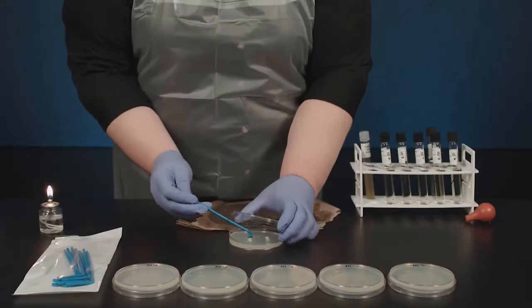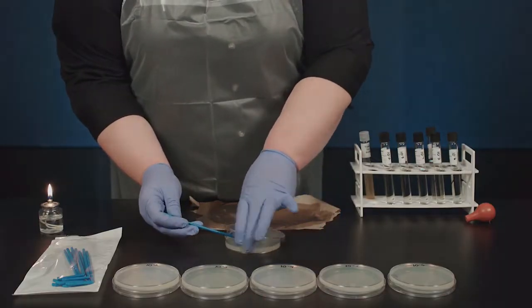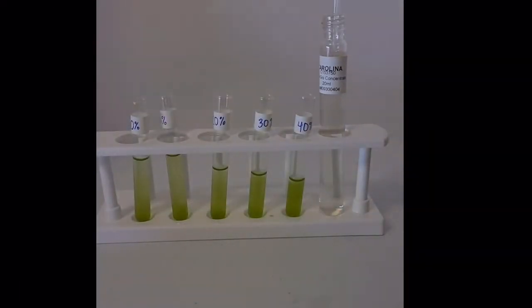A serial dilution can also create a range of experimental conditions such as evaluating the effect of fertilizer concentration on plant growth or determining the lethal dose of a substance.